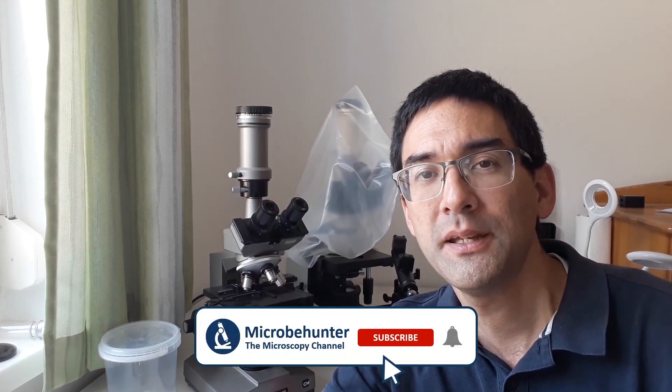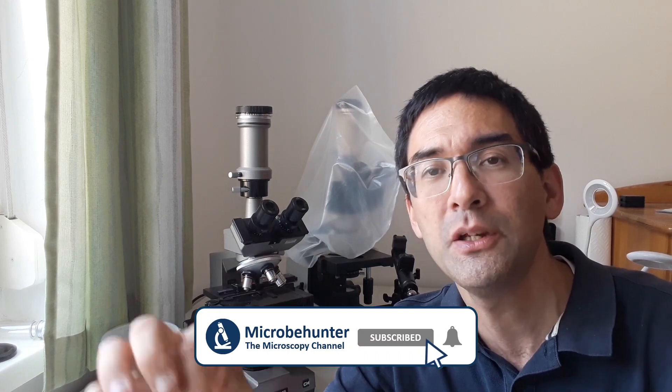A little bit of background information first. Normally you use a mounting medium that turns solid if you want to preserve a specimen on a microscope slide. So you basically place the mounting medium on the slide, specimen goes inside, and then the cover glass. After some time the mounting medium is going to turn solid and then you basically have a specimen slide that maybe can last even a hundred years.